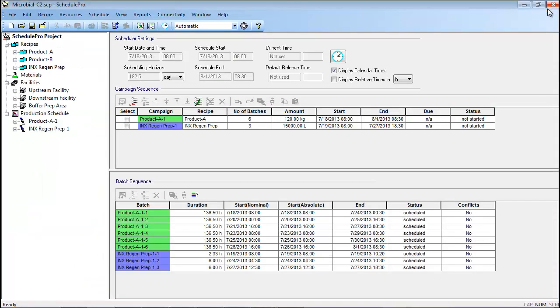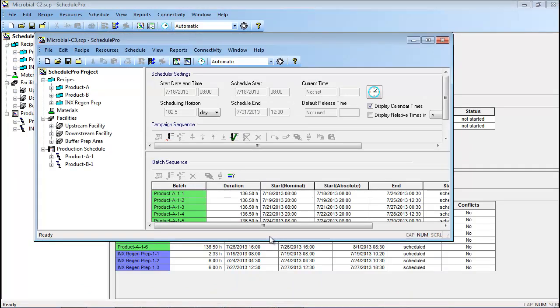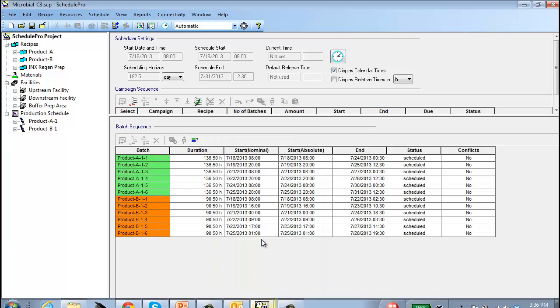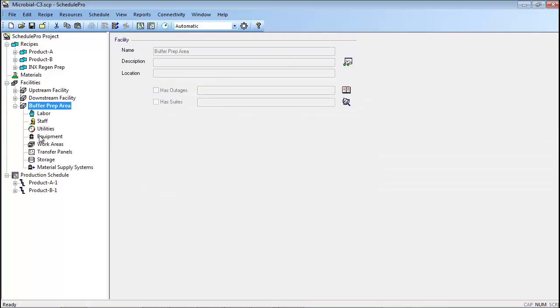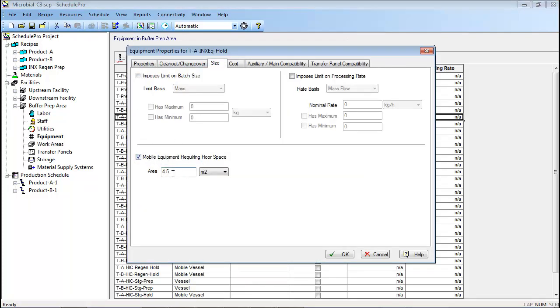This next case describes the use of disposable bags, rather than fixed tanks, for storage of materials. This case is similar to case C1, which was described previously. However, in this case the buffers are prepared and then stored in mobile disposable bag units until necessary. This modification was made by editing the properties of various buffer holding units in the buffer prep area facility. For instance, the specifications for holding unit TA-INX-EQ hold were modified to include a 4.5 square meter floor space requirement on the size tab. This space requirement includes the space for the bag itself, the storage skid, plus any additional space around the unit required for material handling, connections, etc. Similar modifications were made to other holding tanks, although different floor space requirements were assigned to various units.